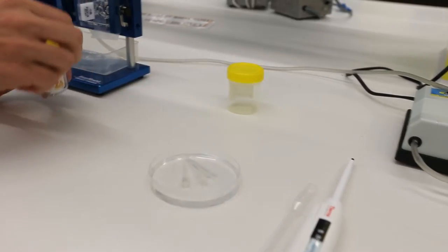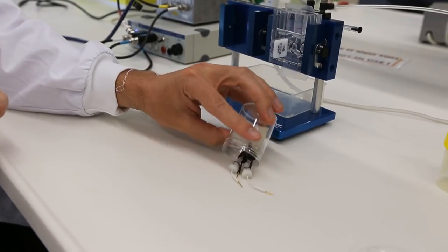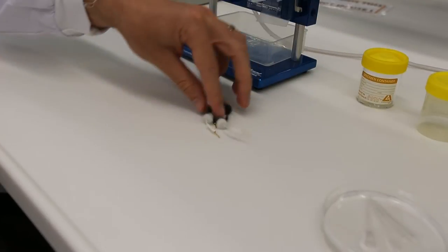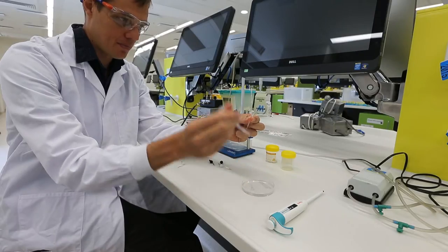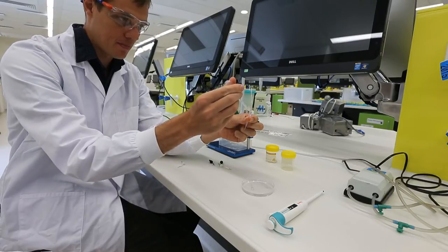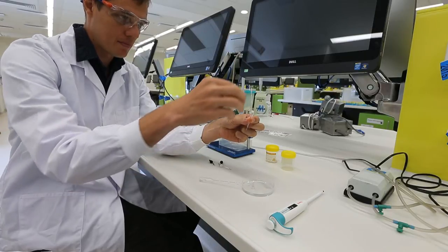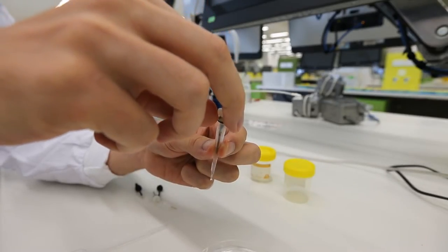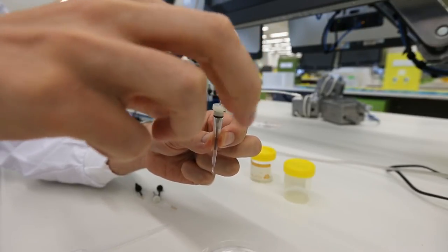Next, we will need to assemble the electrodes. In the second specimen jar, you will find two white and two black electrodes. To assemble the electrodes, take one of the agar bridges, ensuring that it is topped up with 3 molar potassium chloride solution. Take one of the white electrodes and insert it into the agar bridge. It is essential that you do not introduce any air bubbles when you do this, otherwise the electrode will not work.